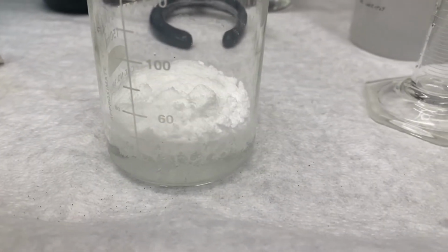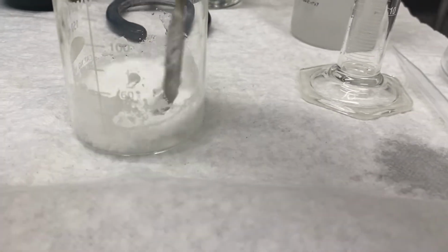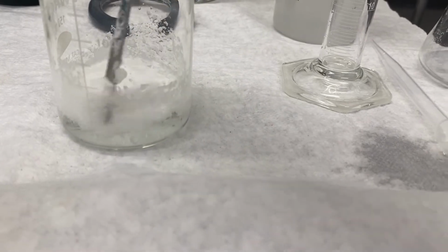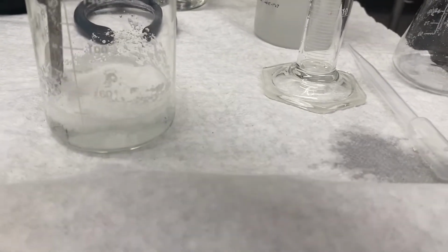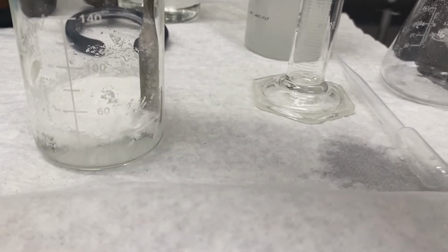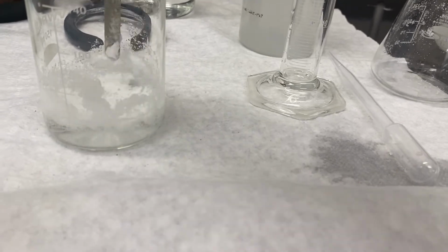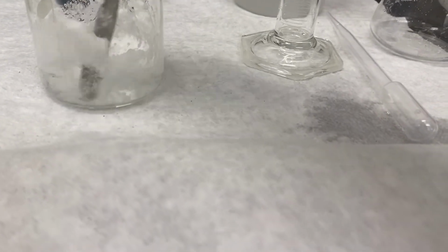So you see it's kind of fizzing, bubbling up. I'm going to mix it up as well. Now, sodium bicarbonate is a base, and you can look at the structure of aspirin and see that it still has its carboxylic acid functionality intact. So you can imagine what this reaction will look like. So you could create that scheme. I believe that's one of your questions in either your pre-lab or your post-lab.